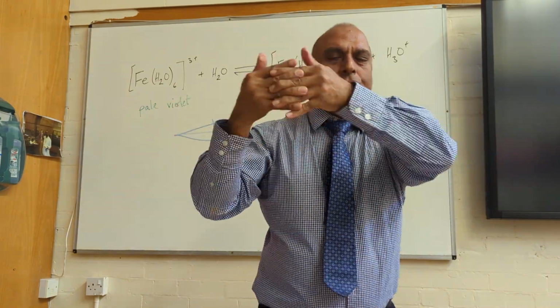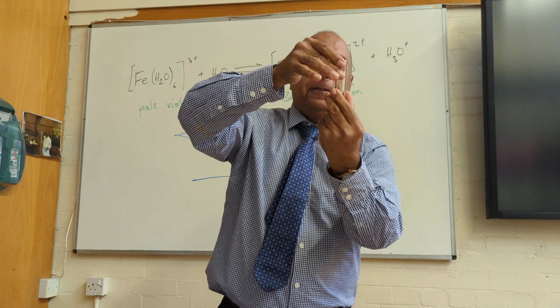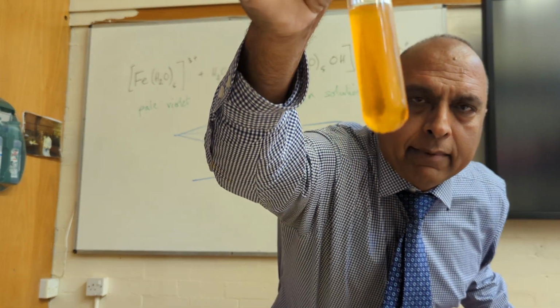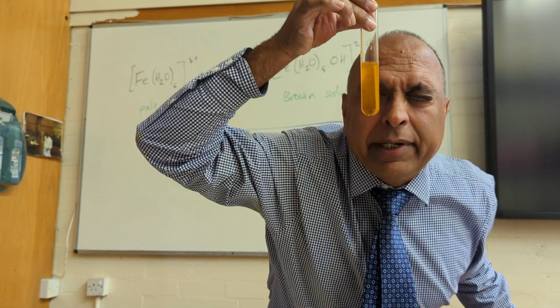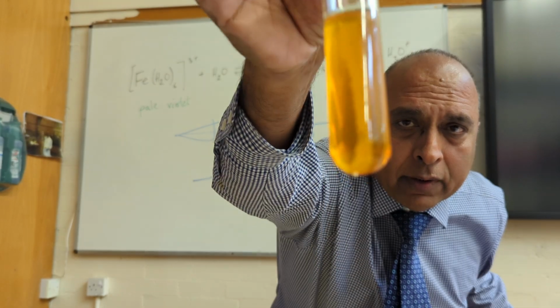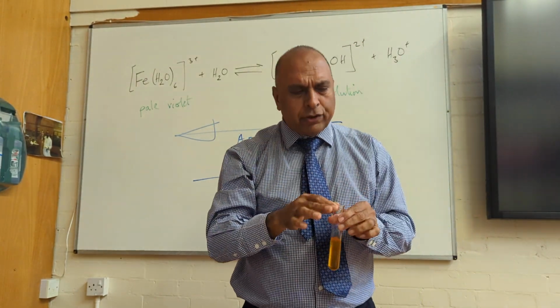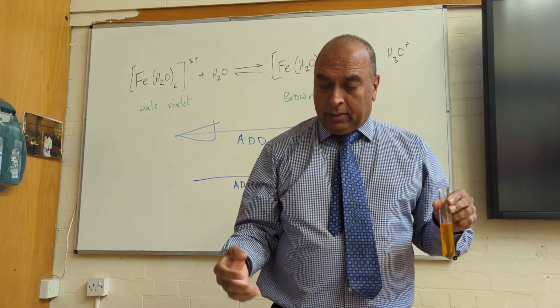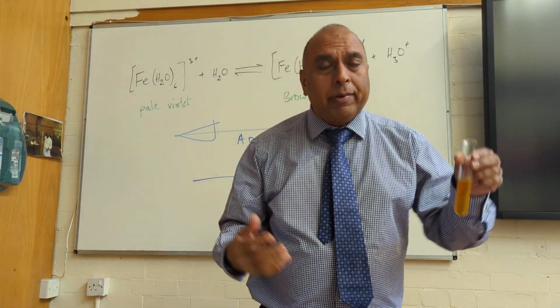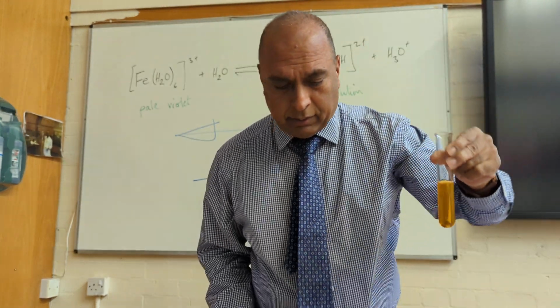A little bit left at the bottom. Let's see if I can get it to dissolve. There. I hope you can see all of that's dissolved. See through it. It's a solution. All dissolved, and it's brown. Whether it's a function of the first hydrolysis reaction or the second one, it doesn't matter, they're both brown. The hydrolysis products are brown, and that's a brown solution.